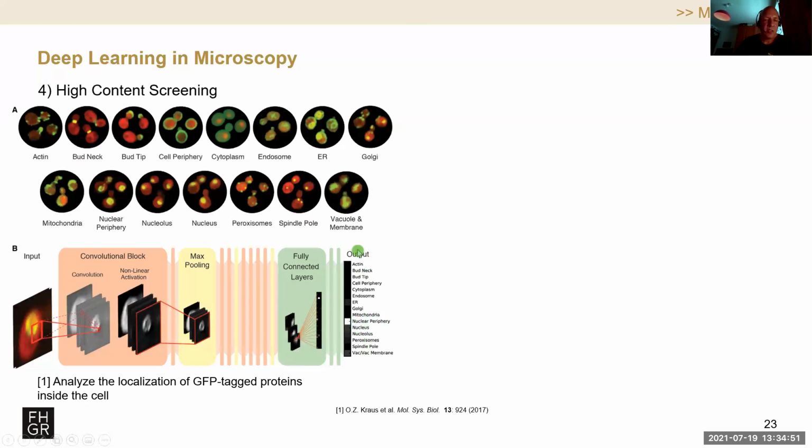Again, I should say that these are predictions that the neural network comes up with, and you will always have one of these classes having the maximum prediction. It's not necessarily that the class that has the maximum prediction is the class that you would think it is. That's one of the drawbacks of neural networks. You will always get an answer. Even if you put a completely nonsense image in there, like the image of your motorcycle, you would get a prediction.